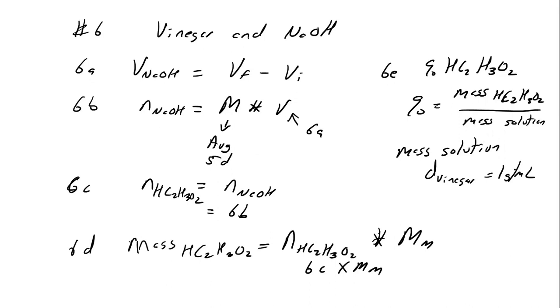If the density is 1, what did I measure out of vinegar? What measurement of vinegar do I make? Look at your procedure. What do I measure out of vinegar? It says vinegar. What measurement of vinegar do I make? It's in the second part. Which milliliters is the unit of? Volume.